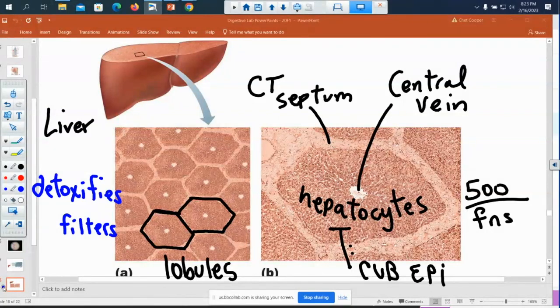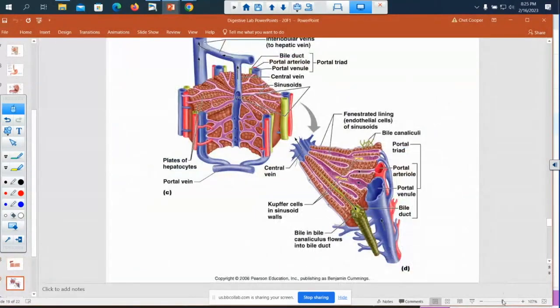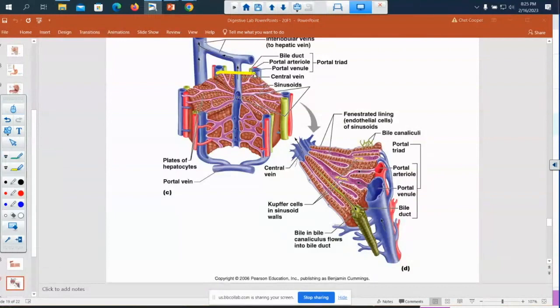So there's your liver slide picture. Okay, this will absolutely not be on the test. It is just to help you with lecture, to understand and to absorb what we just saw by saying, oh, obviously cuboidal cells. Now you can see they're cuboidal. And also, look here.